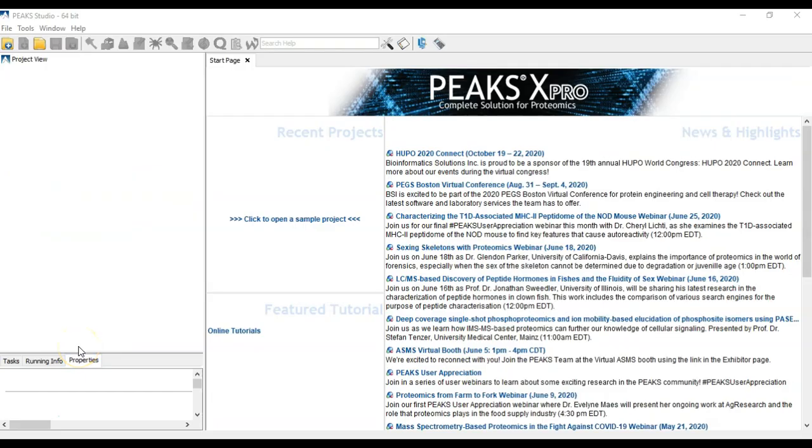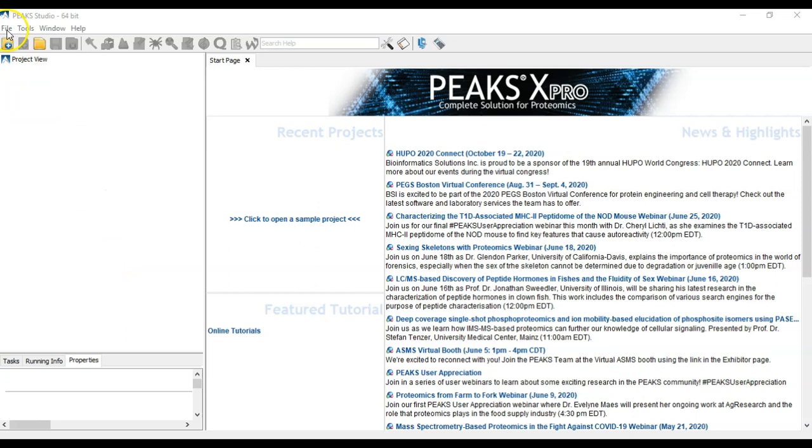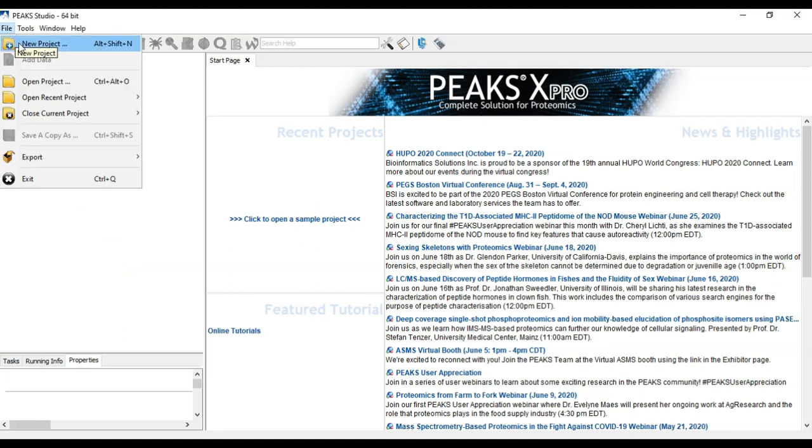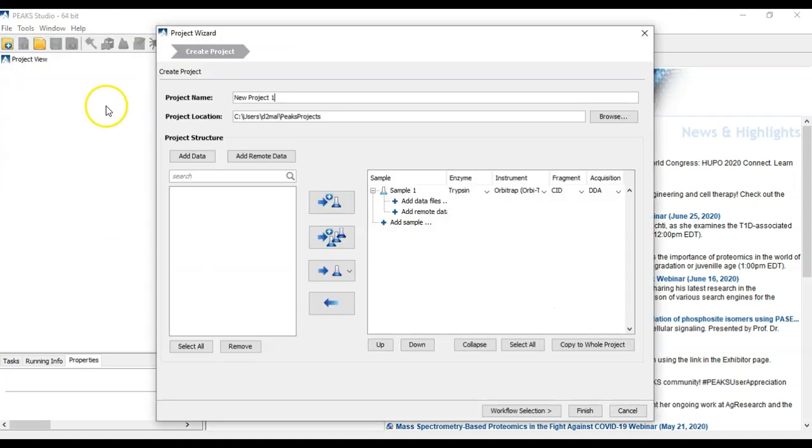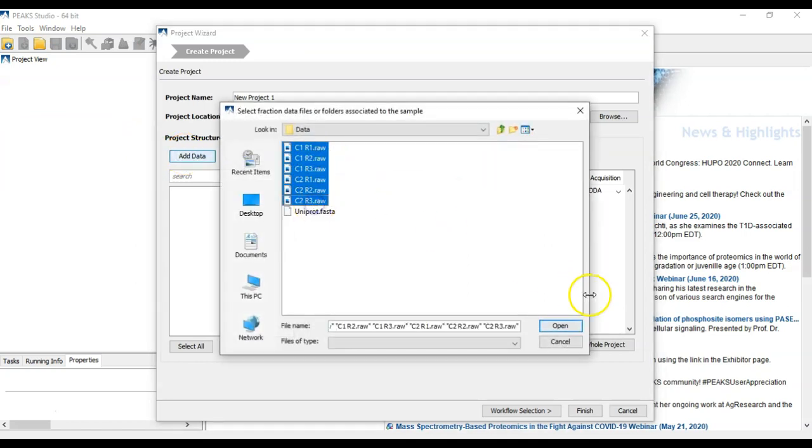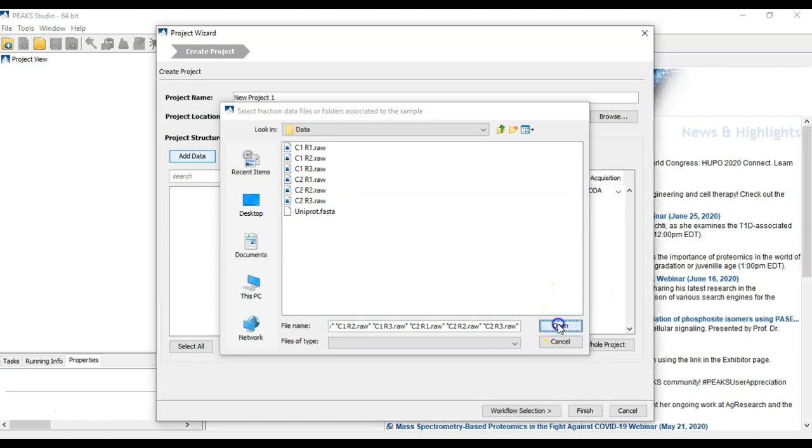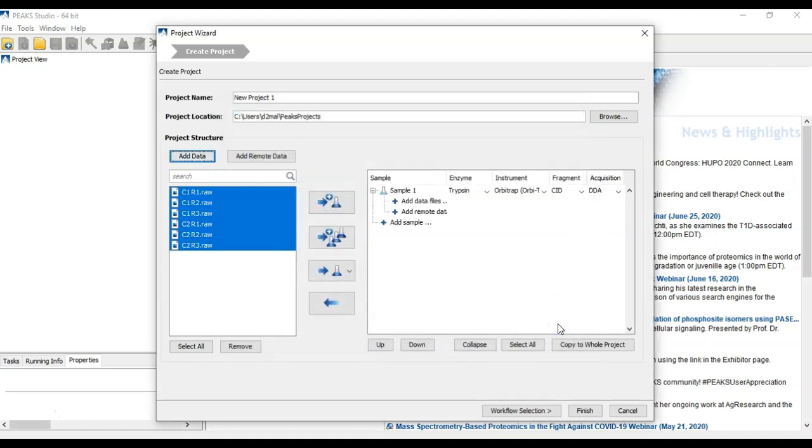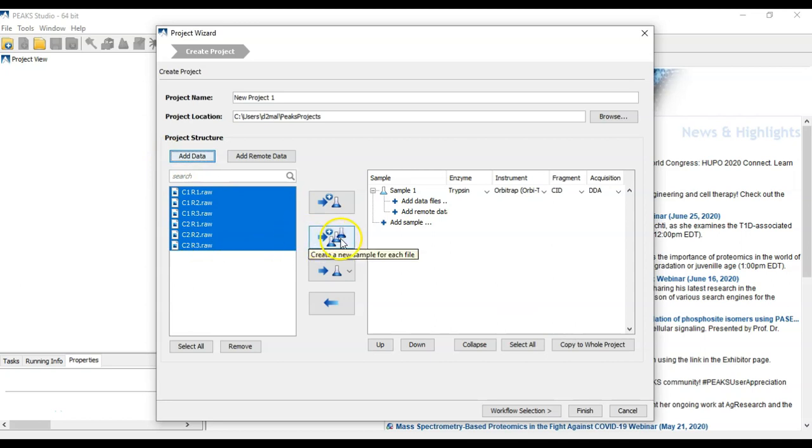Now let's look at setting up a DIA project for our quantification. To do that, you go up to the top left-hand corner, go File, New Project, and start to load your data. In this case, we have two conditions with three replicates each. We want to select all the data and click this button to create a new sample for each file.